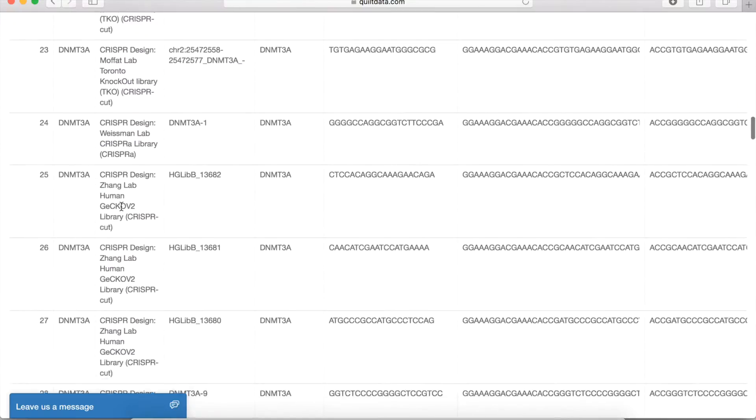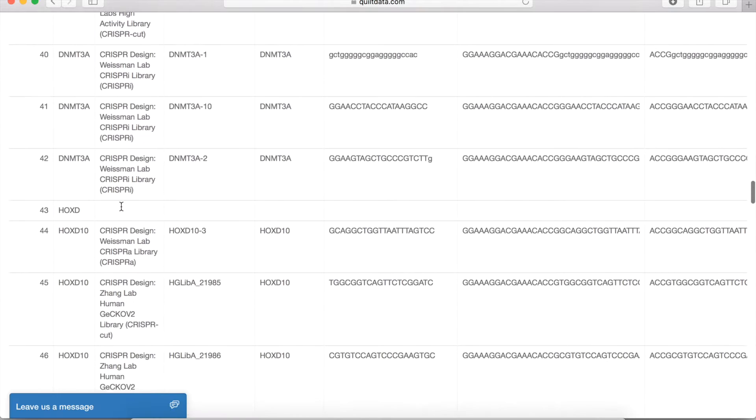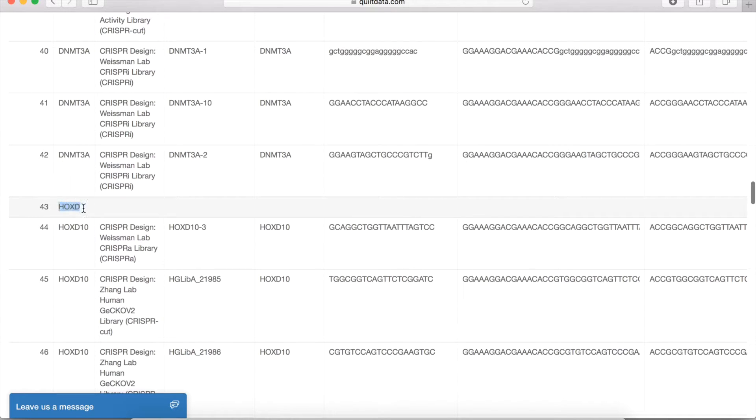You'll notice that if you enter a gene name that doesn't match, we'll return you back an empty row so you know that it didn't work.